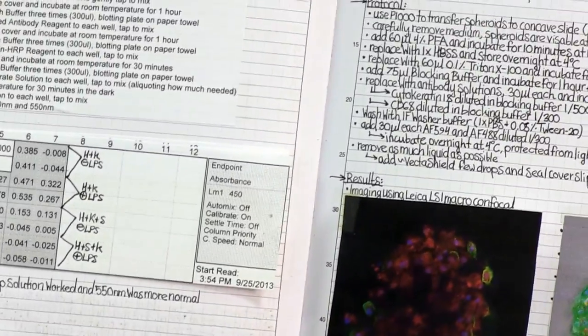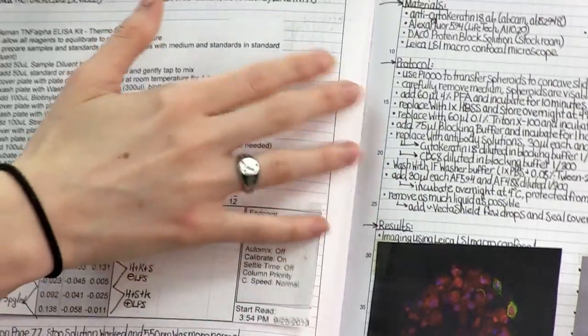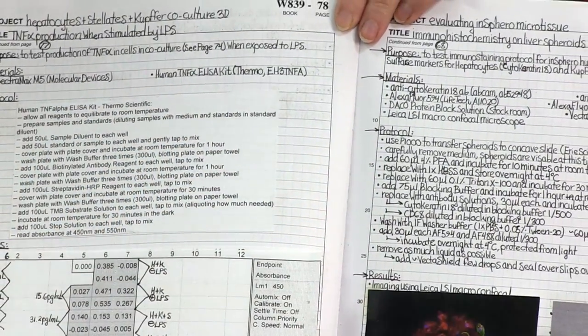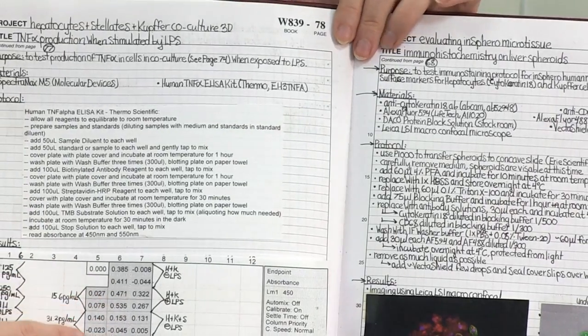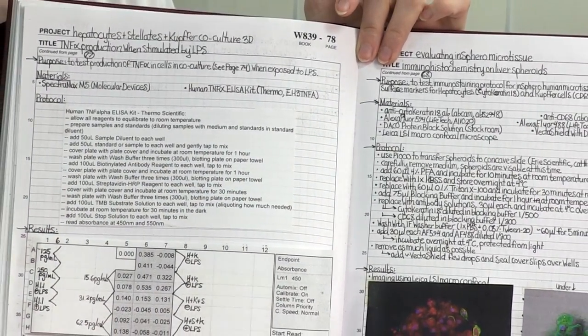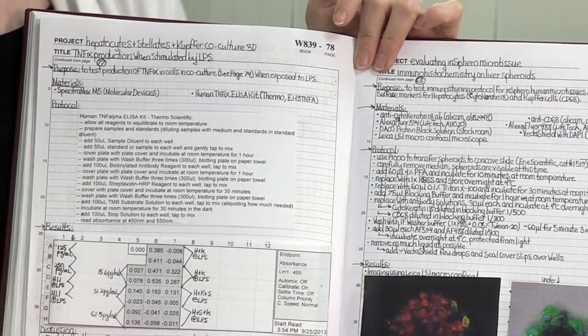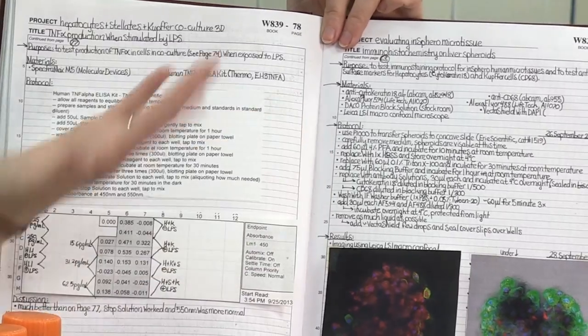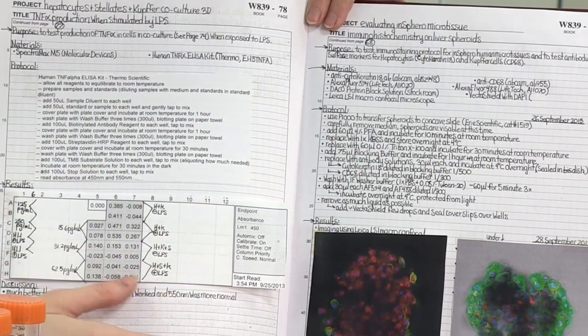Lastly, it's really important to outline your protocol. So I like to write down every little step, even something that doesn't seem relevant at the time. Because later on, you may actually want to look back and say, which media did I use there? And how long did I incubate that for? And if you take really good notes, you'll be able to actually look back and get that information.